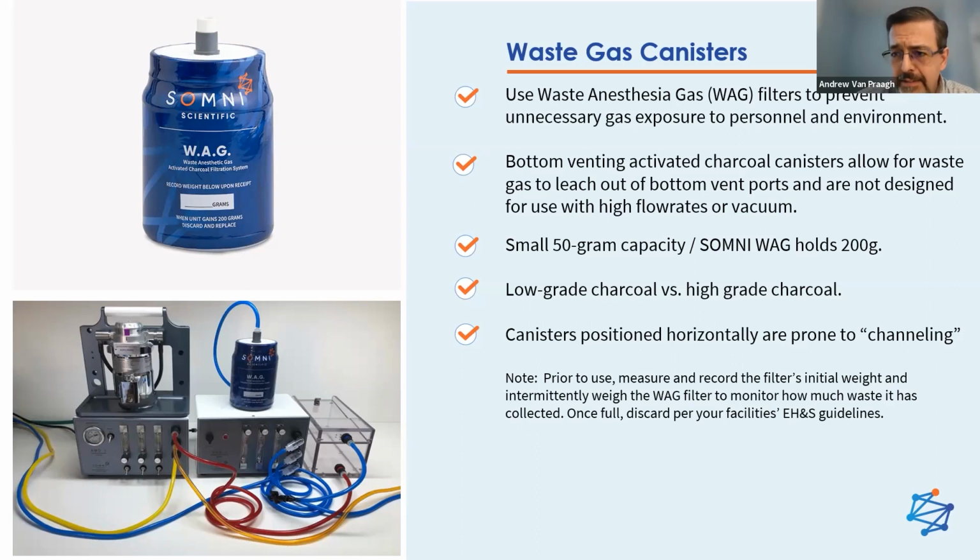All of the evac lines are blue, and they very clearly designate that they're functioning in an evac capacity. And you can see in the case of the induction chamber, we have the large hooded induction chamber where it is using the active evac setup above the perforated lid. And you also have a blue line going off to a lab bench unit, and then off to the left, a blue line coming from the optical imager.